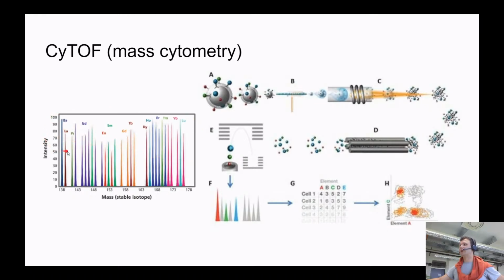But imagine that we somehow made 50 of them very pure, very nicely, like very small crystals. And now, on top of having these 50 metals, we're also going to have 50 very specific antibodies against some specific proteins of interest. These are very good antibodies, very specific for certain proteins. What we're going to do is take antibody by antibody and connect a special metal to the first antibody, another metal to the second antibody, a third metal to the third antibody, etc., etc., etc.